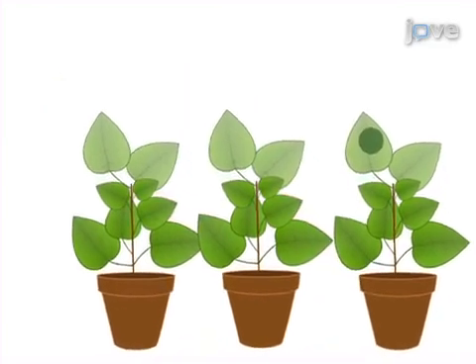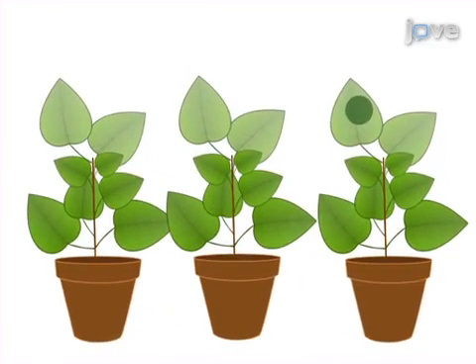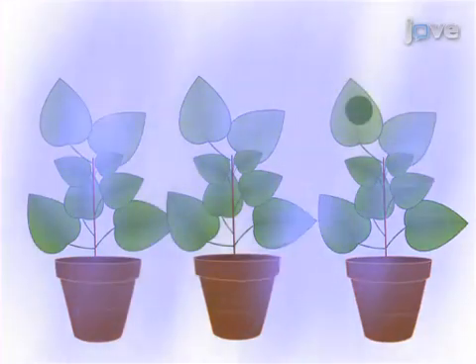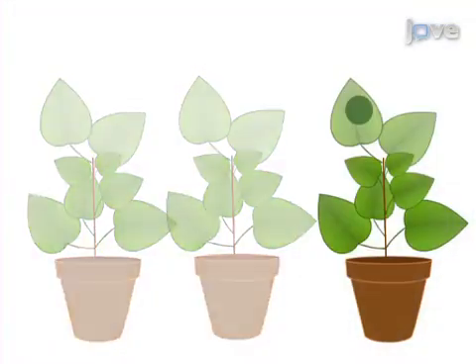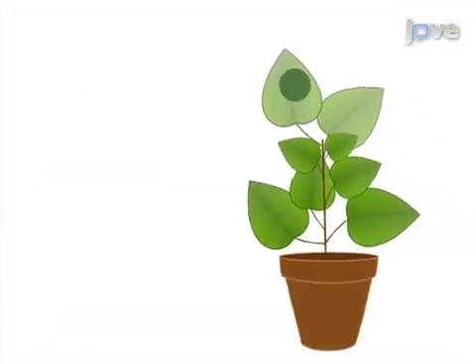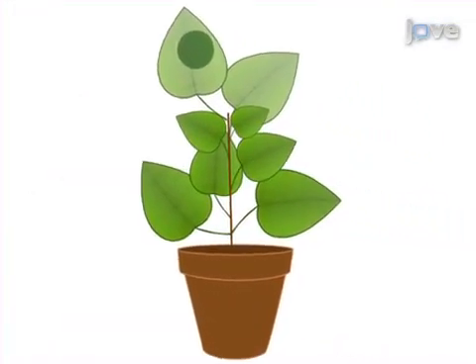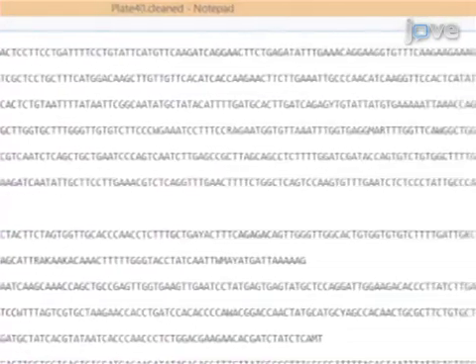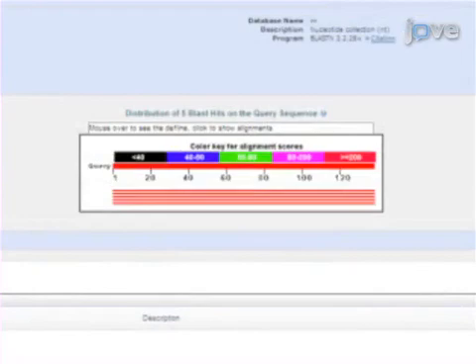Next, assess the green fluorescent colonies of the non-host pathogen under UV light in the dark in order to identify gene-silenced plants that compromise non-host resistance. Identify the target gene by sequencing the insert in the virus vector.